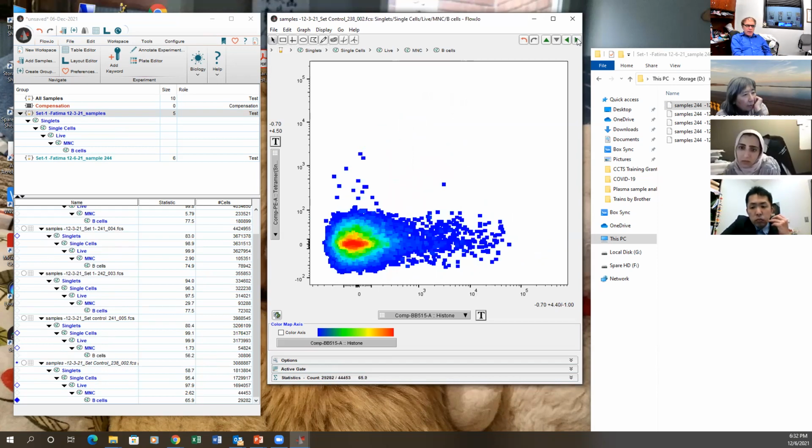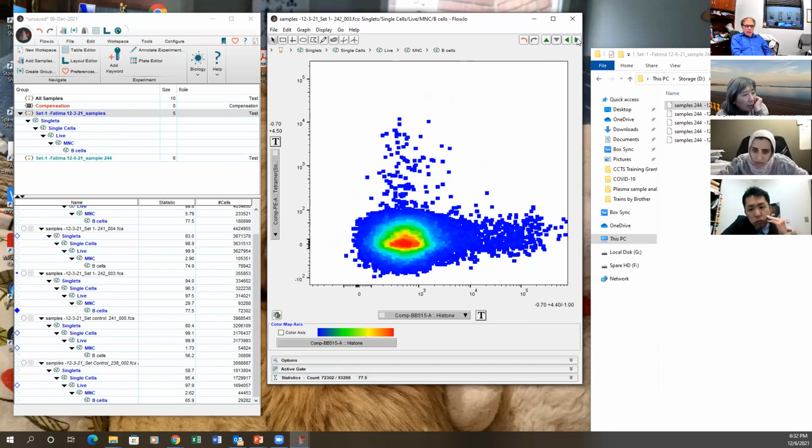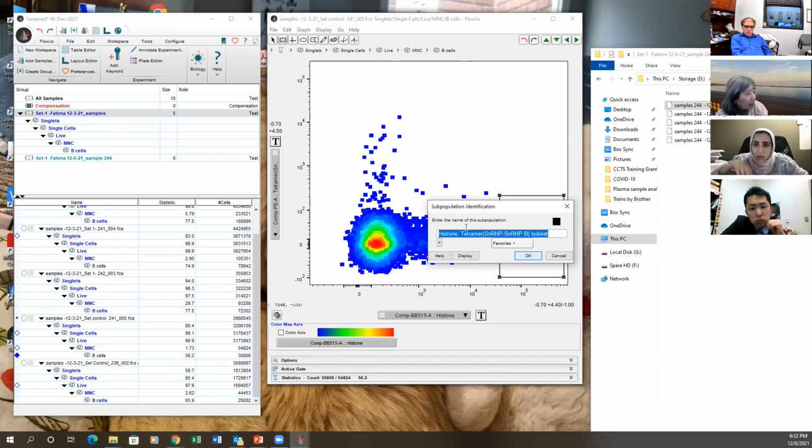Go ahead. You go through the rest of it though. You know how you gate the tetramer positive. I mean, I know it maybe. Just how you would do it. Right. So I'm going to gate here. Anything after that could be real.